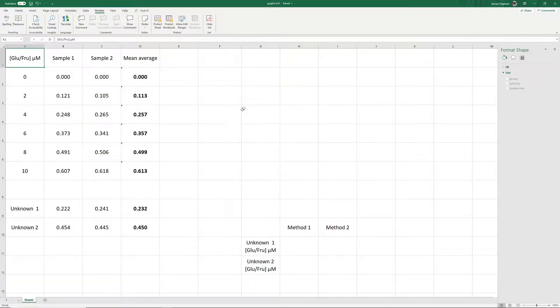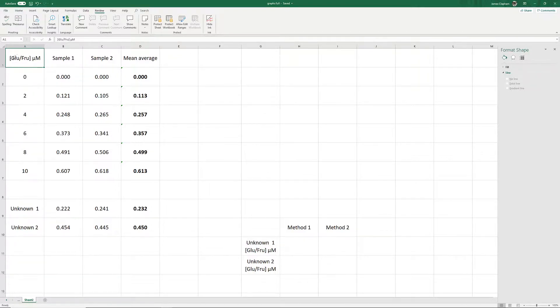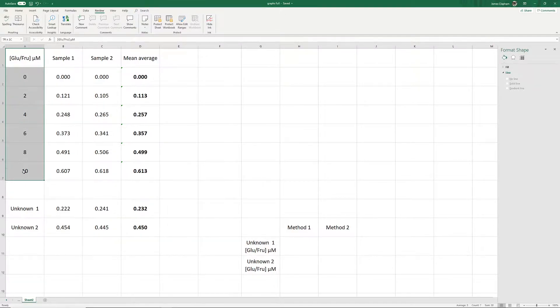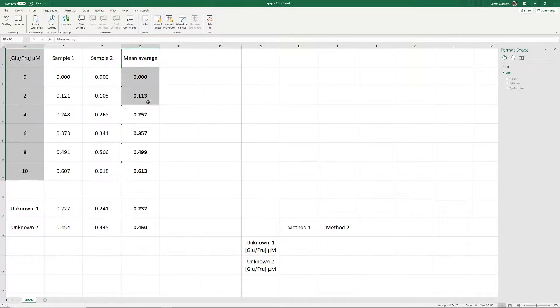So to construct the graph, first we need to select the values we want the graph to be formed from. We select our concentrations here, then hold control and select our mean absorbance readings.